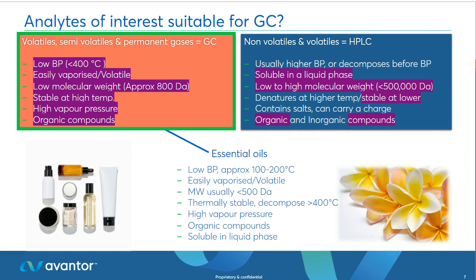But we can still use them with HPLC. It's just that we're going to get better results when we use GC. So it's always good to double check this with each of your analytes.